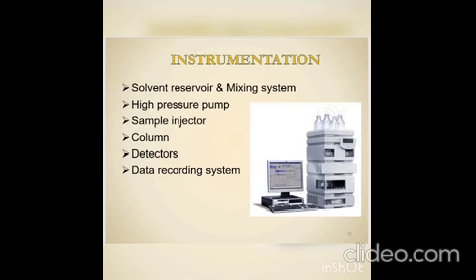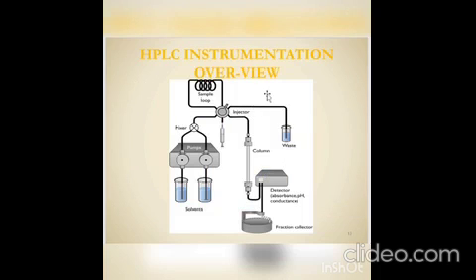This is the HPLC instrumentation overview. These are the solvents, which means these are the mobile phase. It is the pumping unit. This is a mixer. This is a sample loop, and this is the injector, and this is the column.